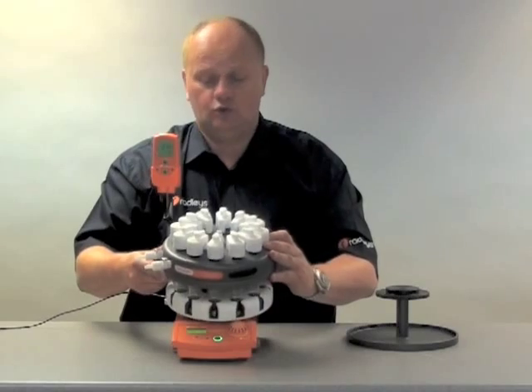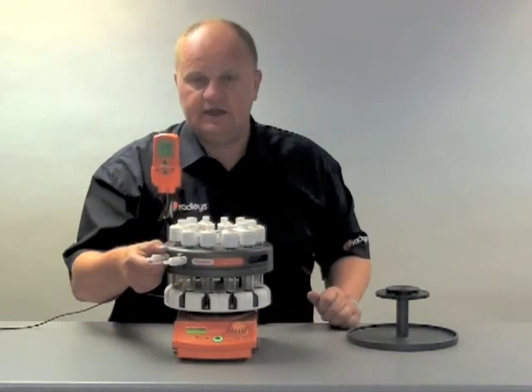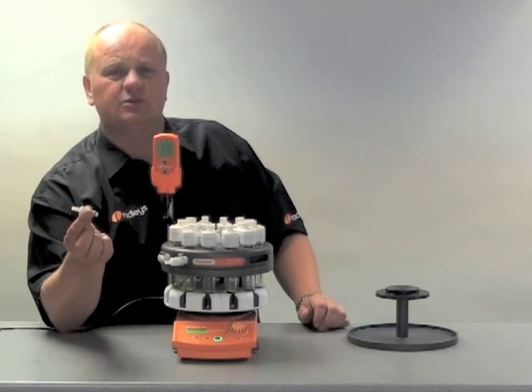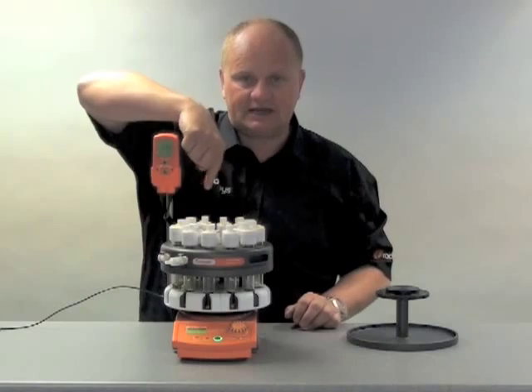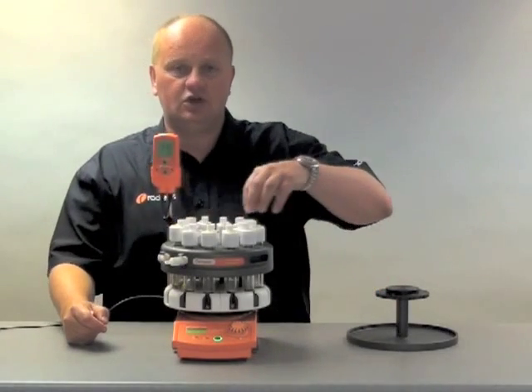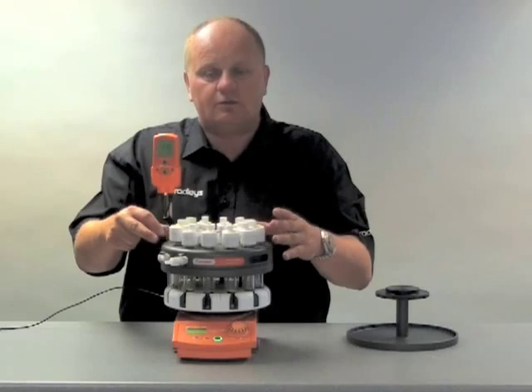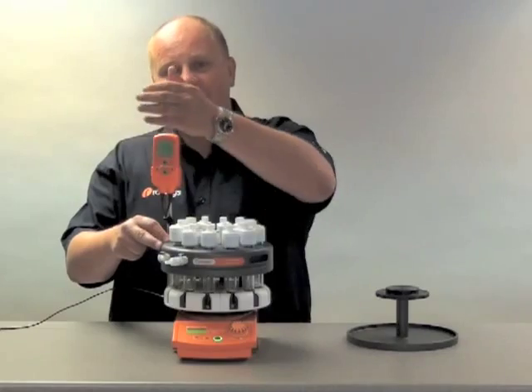This is particularly suitable for cold reactions. This is of course a reflux head. These connectors connect onto hosing to a water supply — typically we would recommend between five and ten degrees. The cooling water comes in, moves round the channel in the head and then departs, providing even cooling to each of the twelve positions. Making this the perfect condenser — and indeed that is what the reflux head is. It is a condenser, replacing the need for twelve separate condensers.